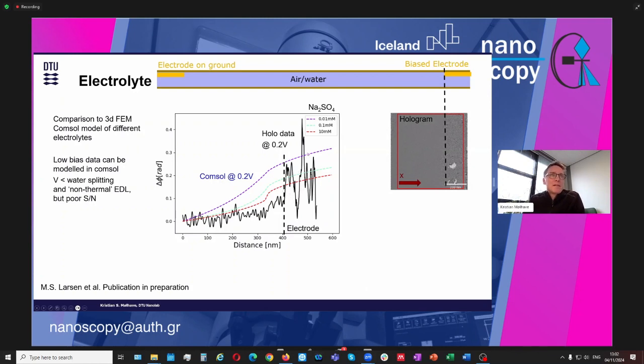But then again, extremely dilute electrolytes in a clamp chipped system here is in a system that's very dominated, first of all, by surfaces that could be slightly dirty, but also we didn't degas the water we were using here. So there's carbon dioxide and other gases present that will increase the conductivity. So it is not unreasonable to think that we are of the order a few millimolar of electrolyte.